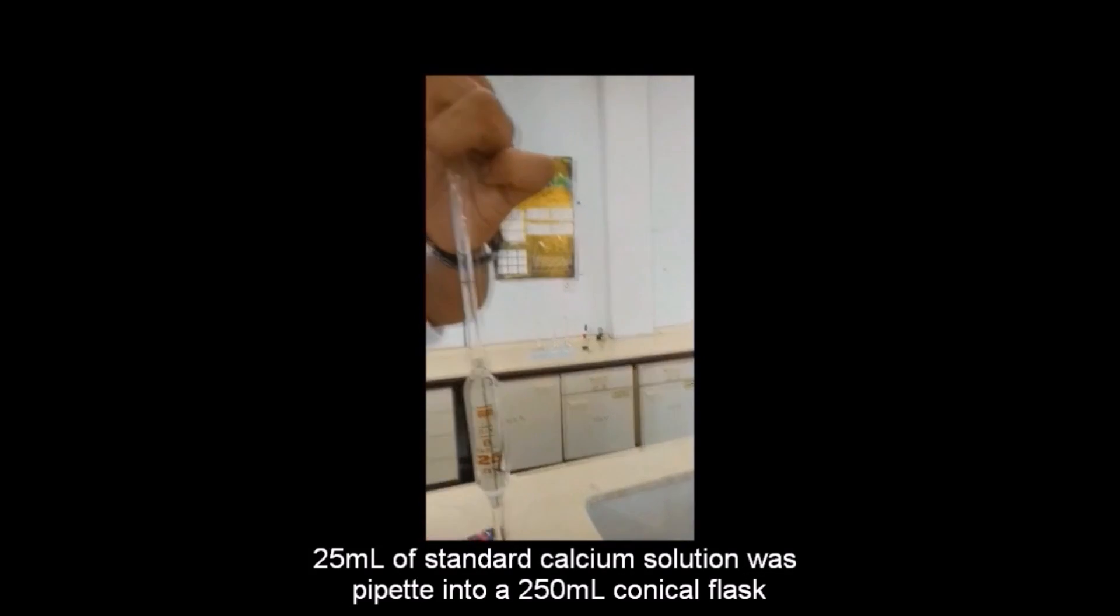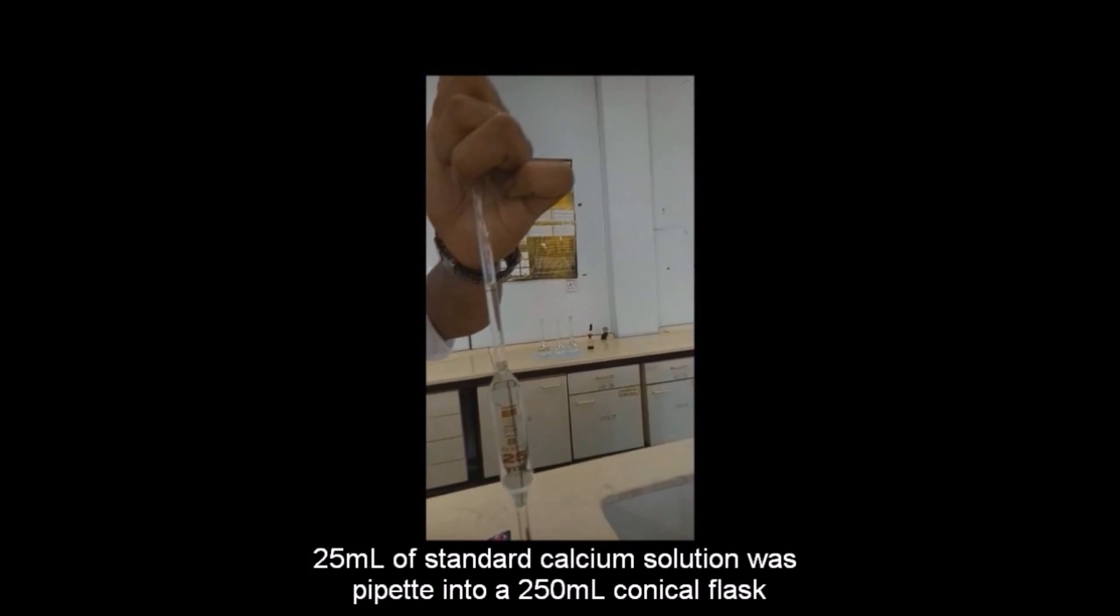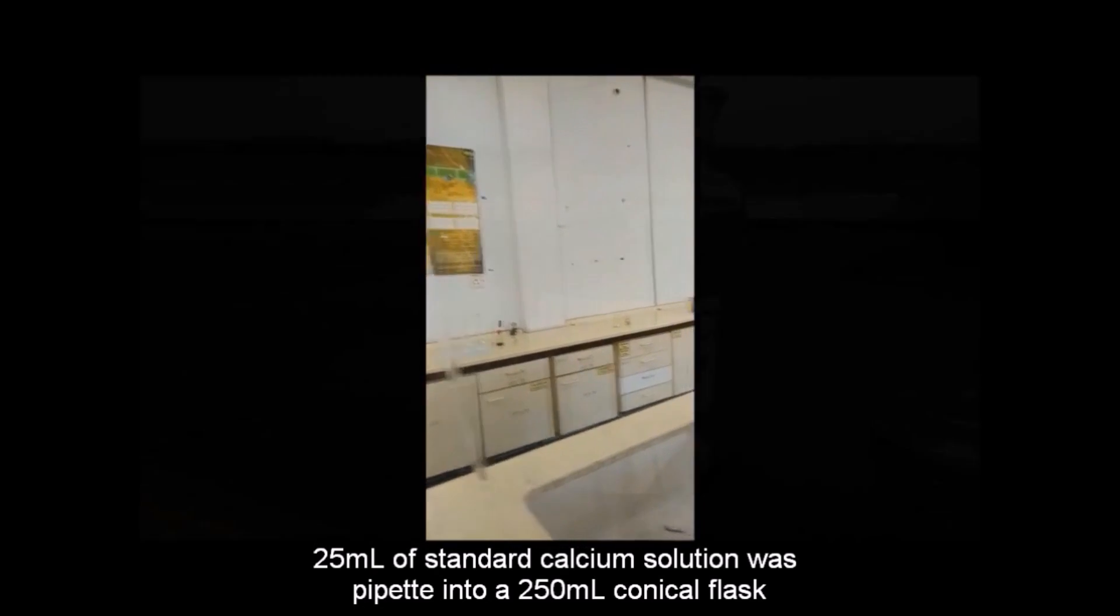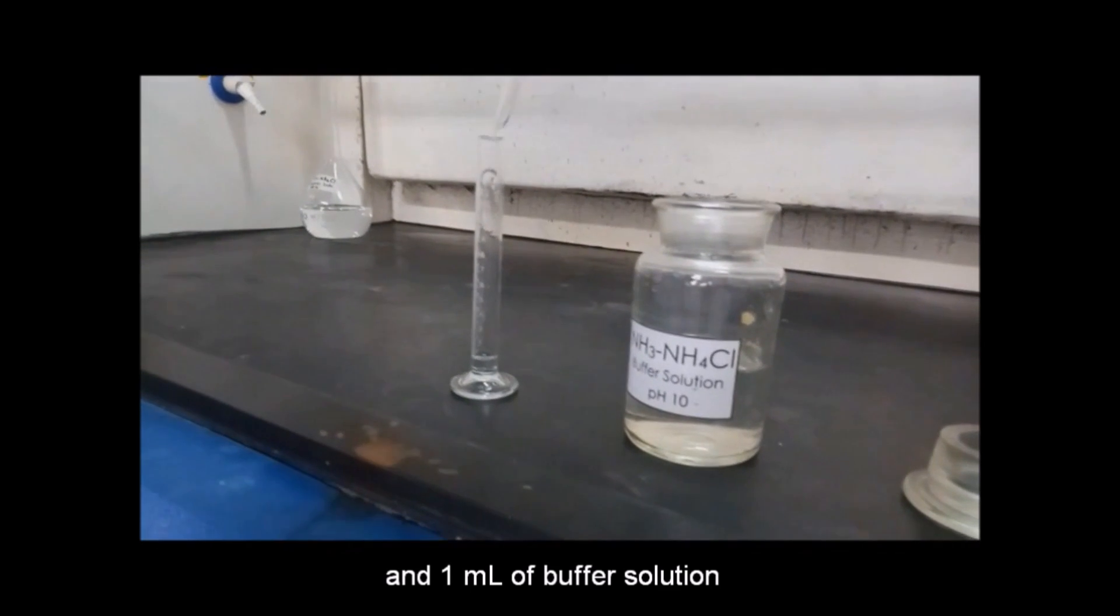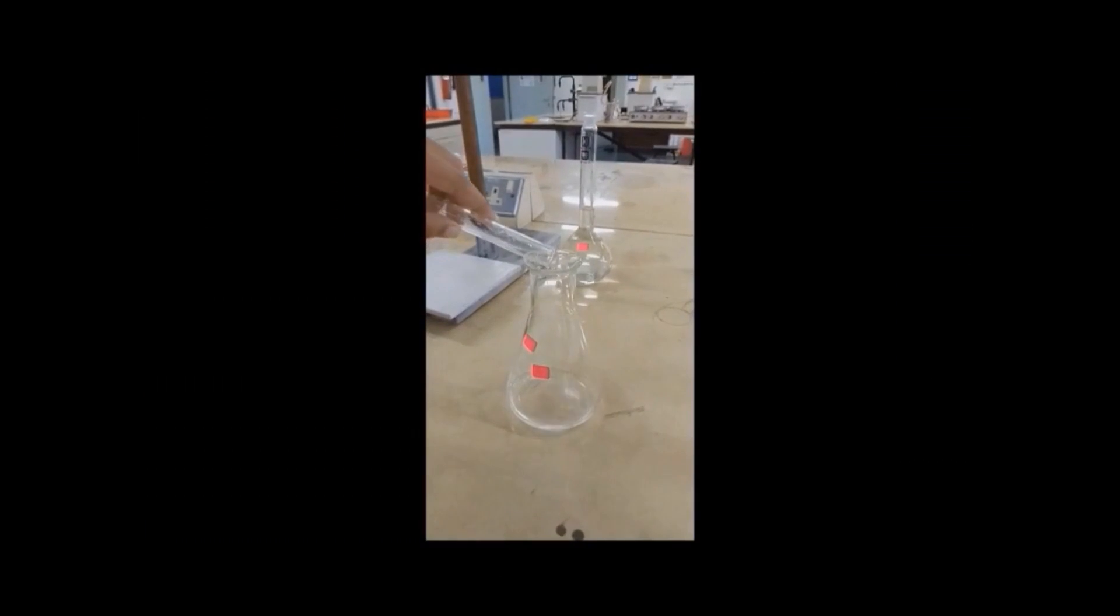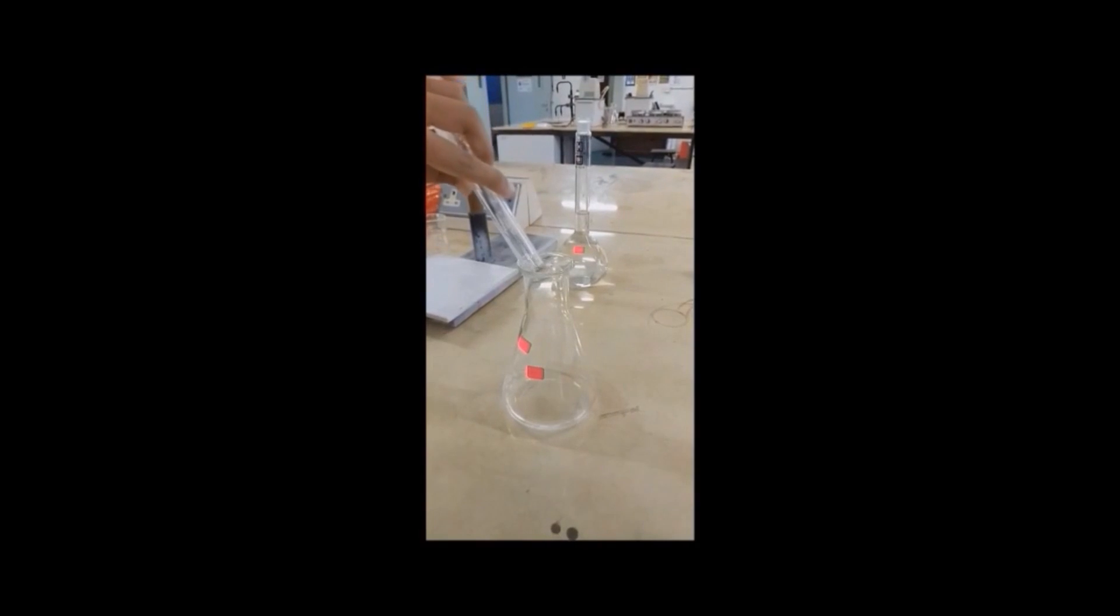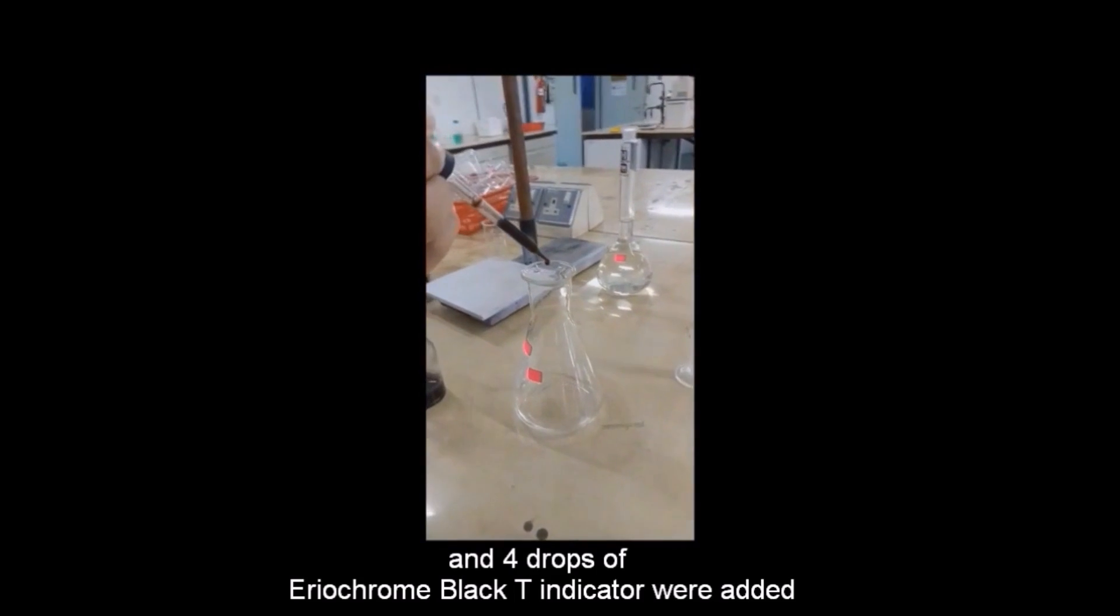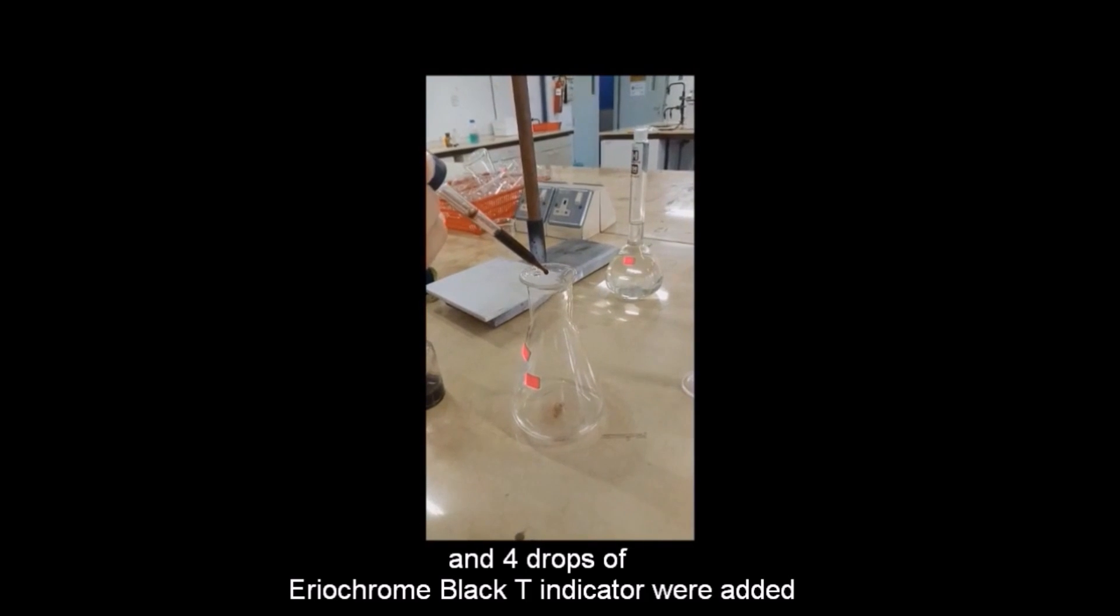25 ml of standard calcium solution was pipetted into a 250 ml conical flask and 1 ml of buffer solution, ammonium chloride, and 4 drops of Eriochrome Black T indicator were added.